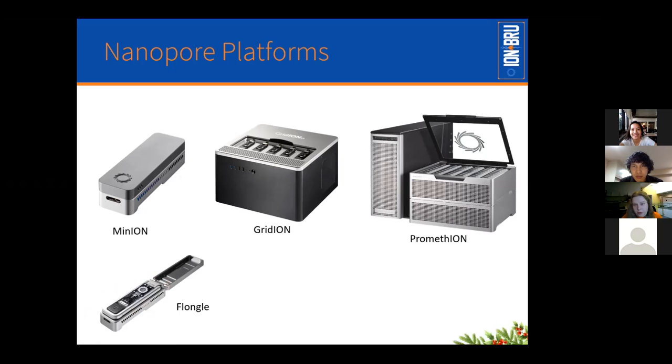It's very low throughput, it's 1 to 2 gigs. But if you're just sequencing a virus, you don't need 1 to 2 gigs. So it's still pretty applicable here if you're interested in trying that. It has got a very short shelf life, which is one thing to note, but it's quite a nice little flow cell.